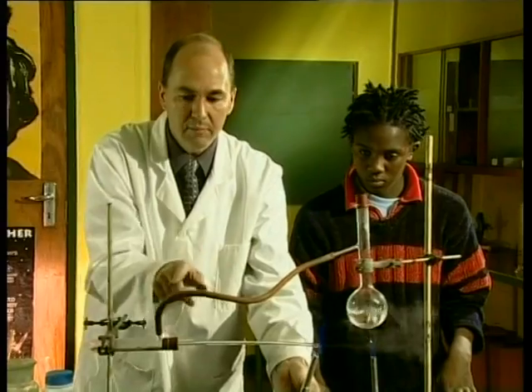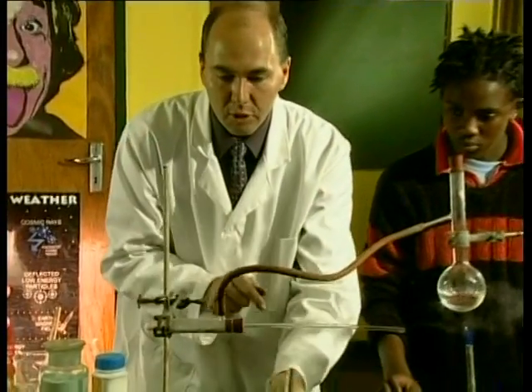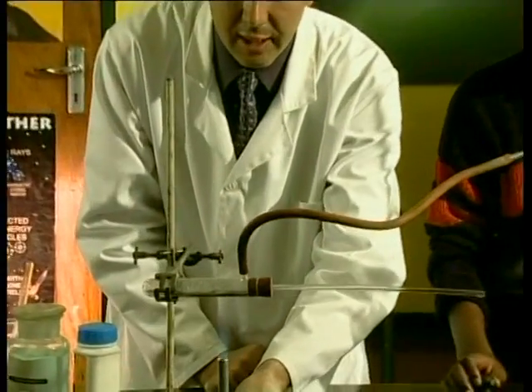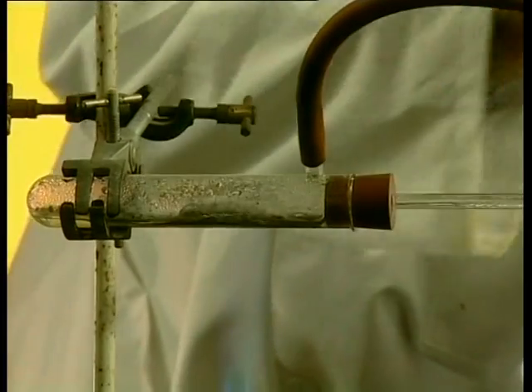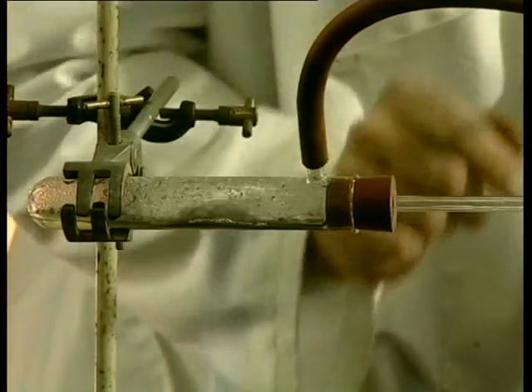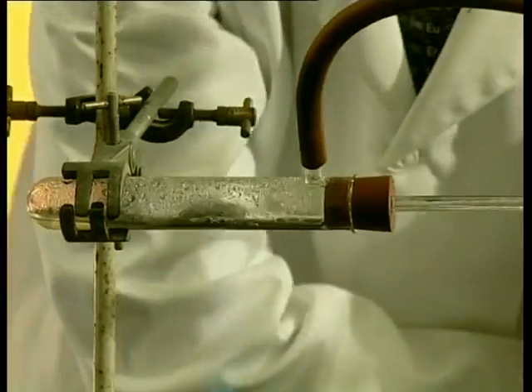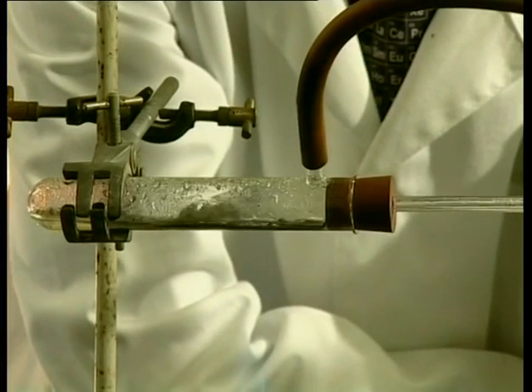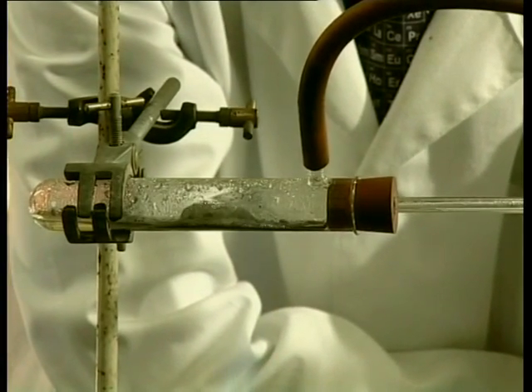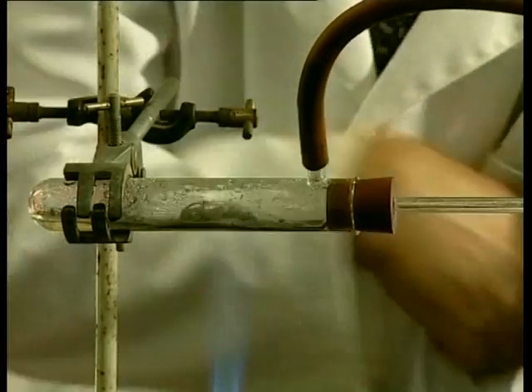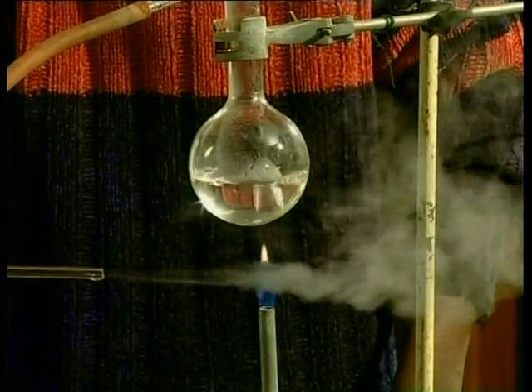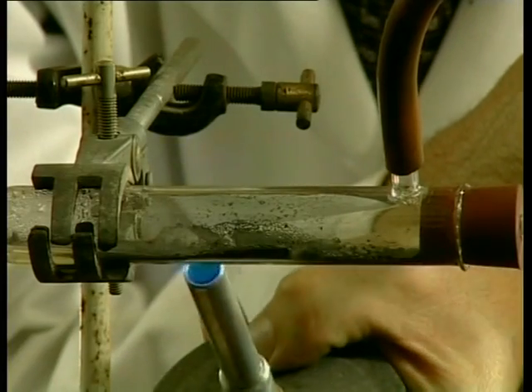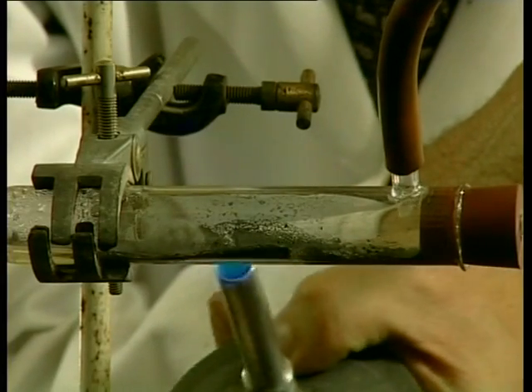We're passing steam over some iron. Have a look at what's happening to the iron when I heat it up. The hot steam passes over the iron and as we heat it up, the iron should start to react with it. We've got lots of steam escaping, but just now we're going to see something else happening as well. As you can see, the iron is changing to a darker colour.